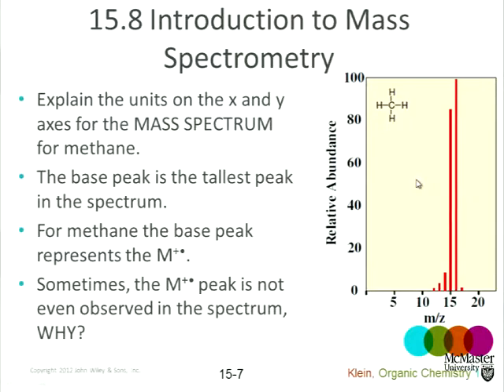Remember, we've seen that methane has the carbon atoms sp3 hybridized. Mix the atomic orbitals, overlap, sp3, tetrahedral, etc., right? So I take a molecule of methane, vaporize it in the mass spectrometer, no problem vaporizing this because methane's a gas to begin with. Blast it with electrons, knock one electron out of one of the CH bonding molecular orbitals. That gives me CH4 dot plus, the molecular ion or parent ion. The CH4 dot plus passes through the magnetic field. It's sorted according to its mass to charge ratio. Carbon is 12, hydrogen's 1, so methane should be 16. So I should see ions arriving at the detector with mass to charge 16, and indeed they do.